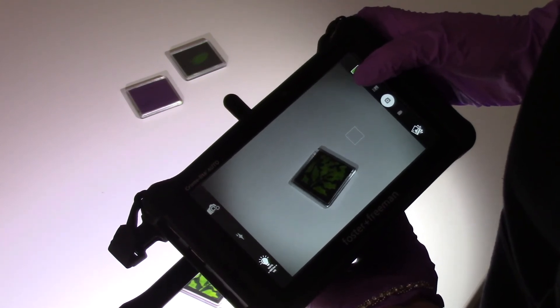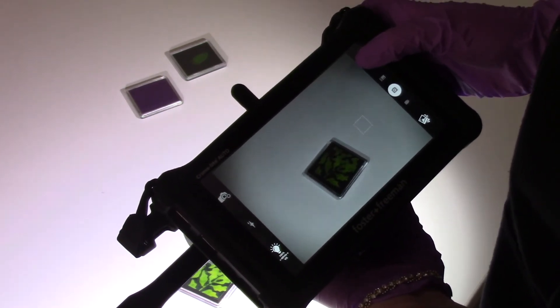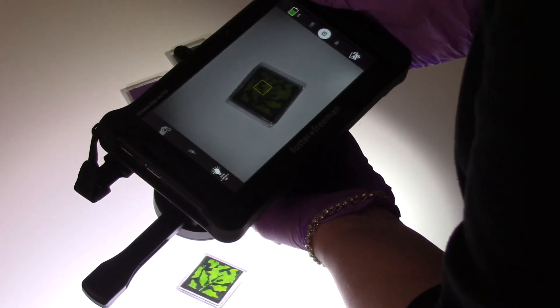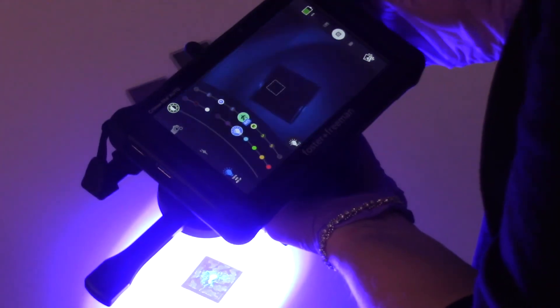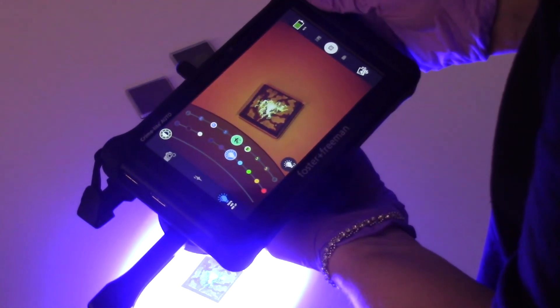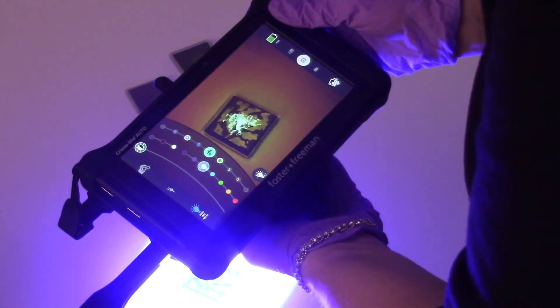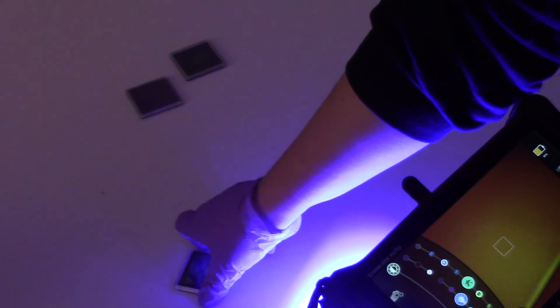Here we have the Crimelight Auto in live view mode. As we screen this piece of fabric with the white light, we can't really see much upon it. This sample actually has a number of fluorescent fibres over the top, and if we simply switch to a blue light source with a 495 long-pass filter, we can very clearly see evidence of fibres fluorescing on the fabric which were previously invisible. Each sample in the kit has a label on the back giving you the appropriate light sources and filters to use with that specific evidence type.